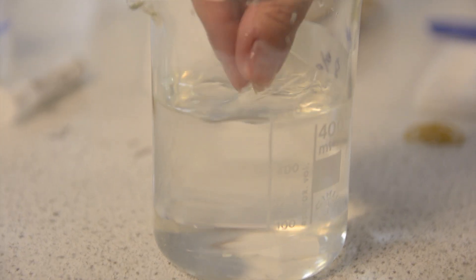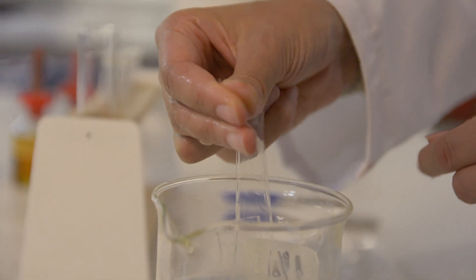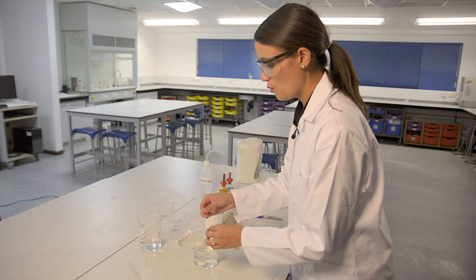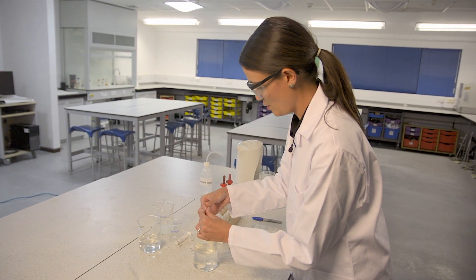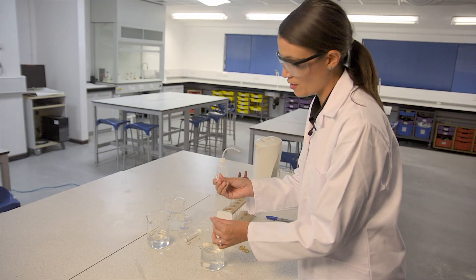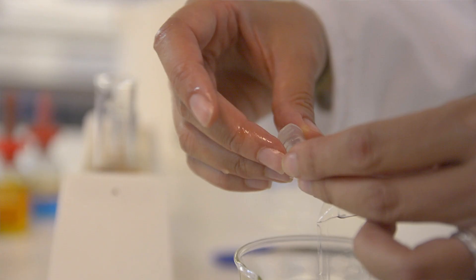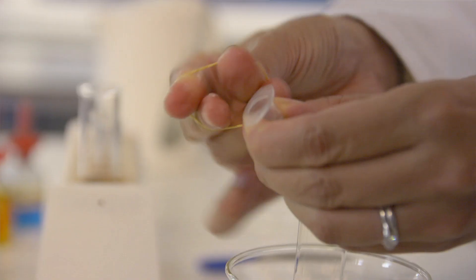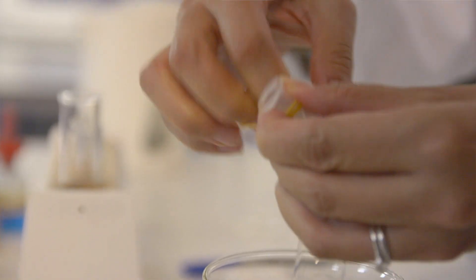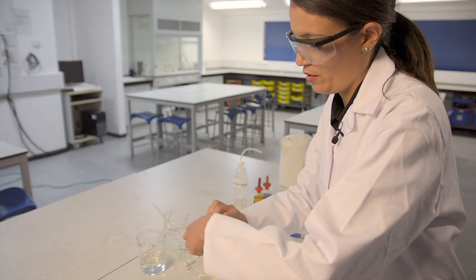We need to soak the visking tubing in water for a few minutes, then it should be flexible enough to work with. You want to hold one end of the tubing open, and an easy way to do that is to use the end of a sawn-off syringe. Once that's in there, I'm just going to secure it with a rubber band, and I'm simply going to tie a knot at the other end of the tubing.